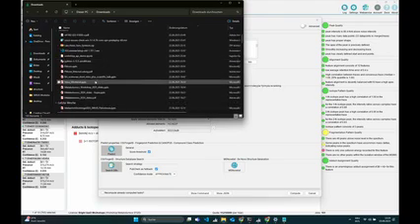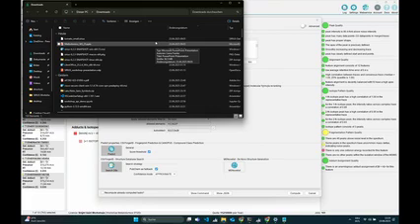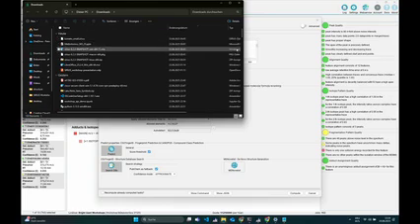Unfortunately, seems not to be the case. No, I don't have the figure here. But it's basically the COSMIC paper from 2022. There is the evaluation of how the confidence score corresponds to FDR, and I think that's where you can look up which amount of error you are willing to accept, basically.